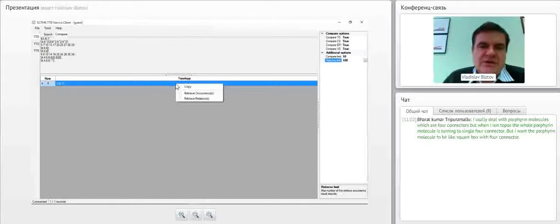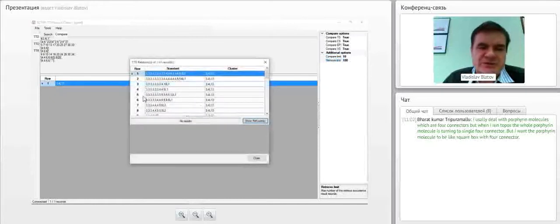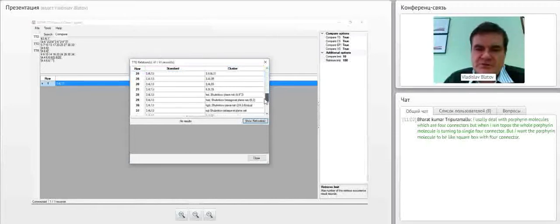And now we really address to the TTR collection, topological types relations, while before, we addressed to TTO collection when we looked for real examples of this topology. And here we see that there are really 41 examples of relations of this topology with other topologies.